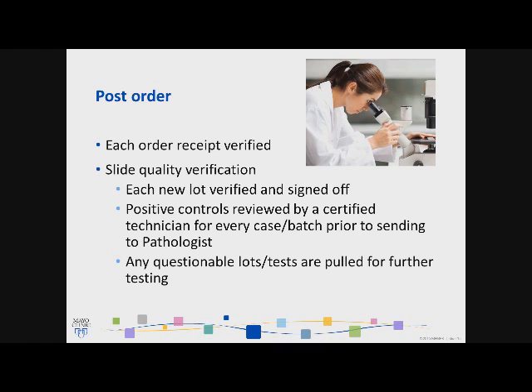So with each post order, we really like to verify that we have that order, and with each slide quality, we need to make sure that quality is sufficient before we send it back to the pathologist. We also like to verify when each new lot has come in.